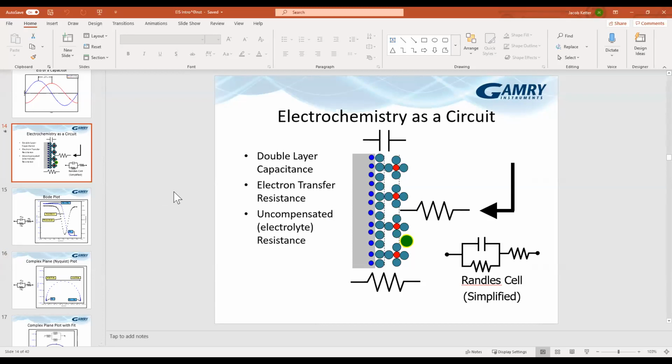It depends on the frequencies you're going to, and it depends on the dimensions of your cylinder. For most cylindrical samples, for like corrosion where you're in the 5 square centimeter range, or cylinders that are millimeters in diameter, versus impedance spectra that are going down into the millihertz range, you're not going to see a difference. Because what's happening is the radial diffusion component kicks in at way too low of a frequency. You're going to have other mass transport effects that screw it up, and you're not going to be able to measure. I mean, you don't make those types of measurements with electrodes that size.